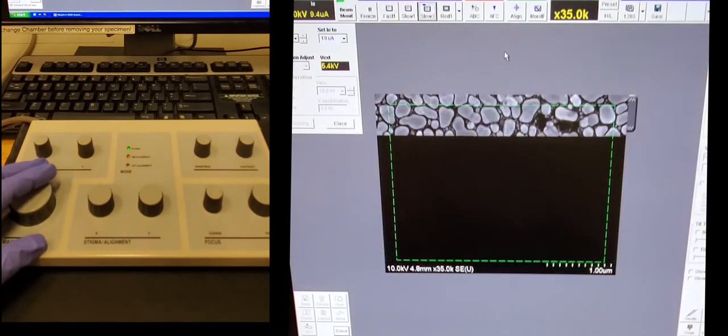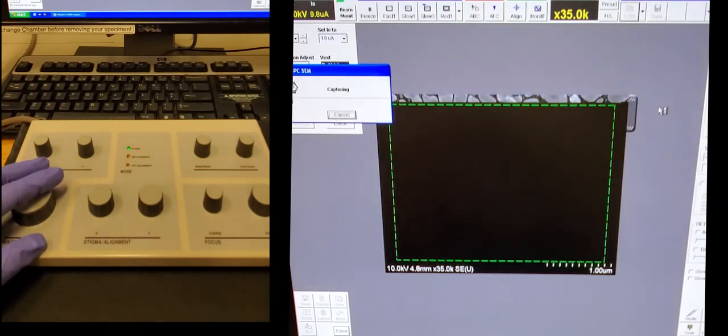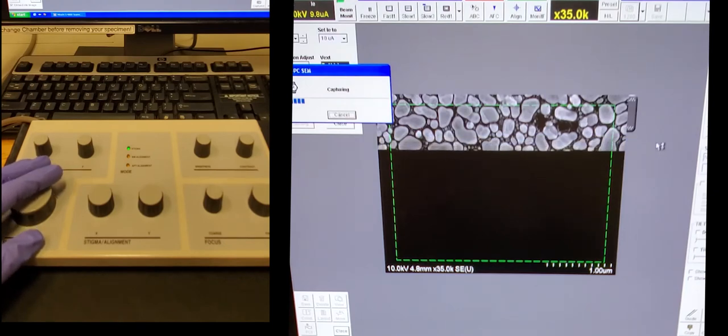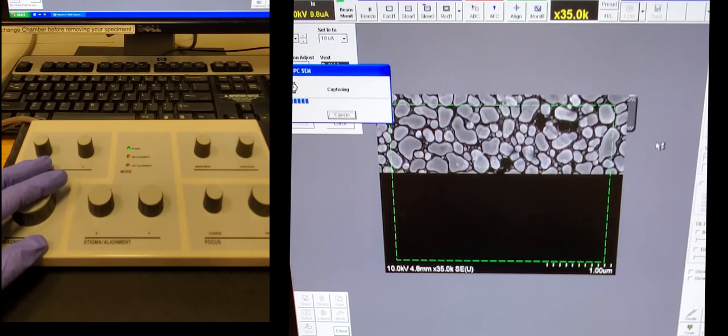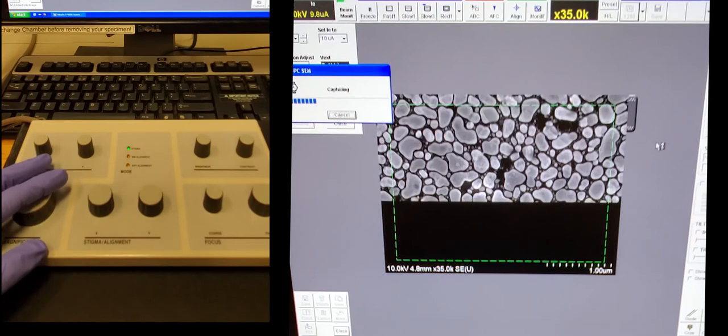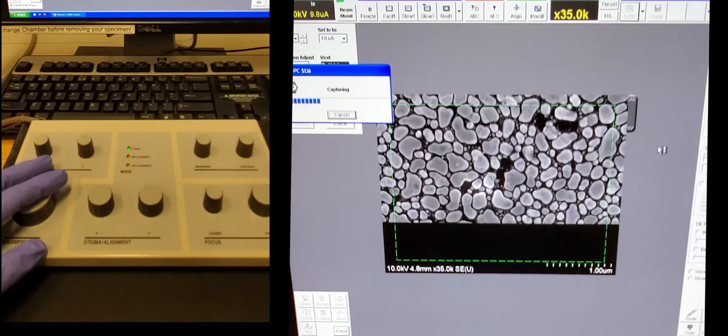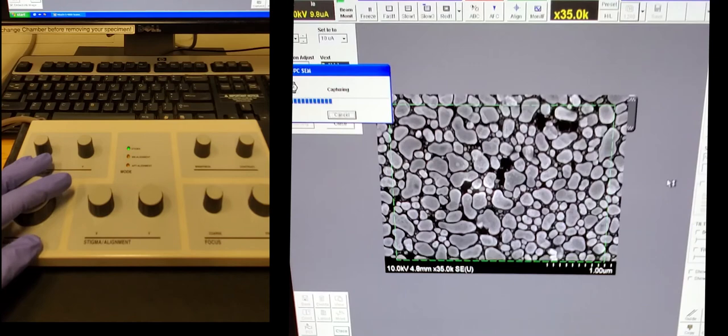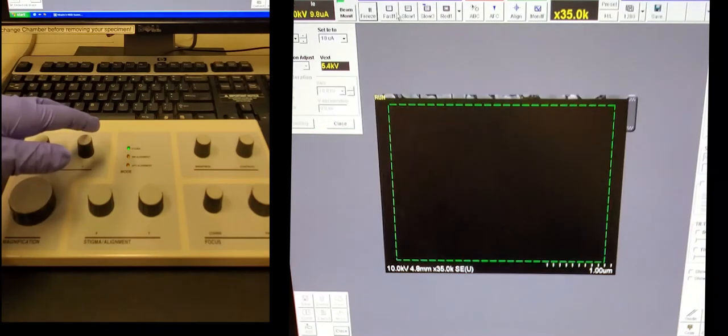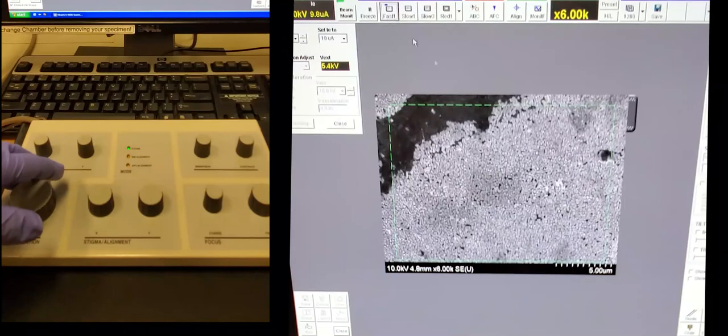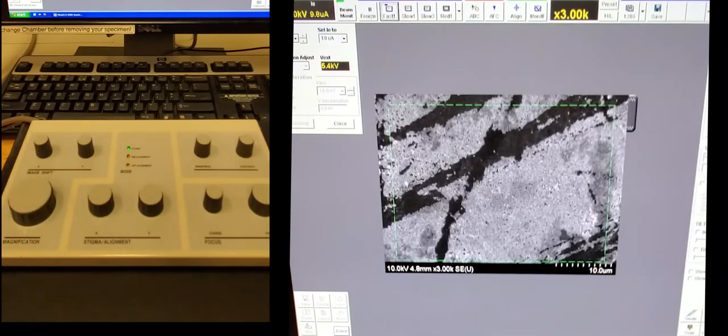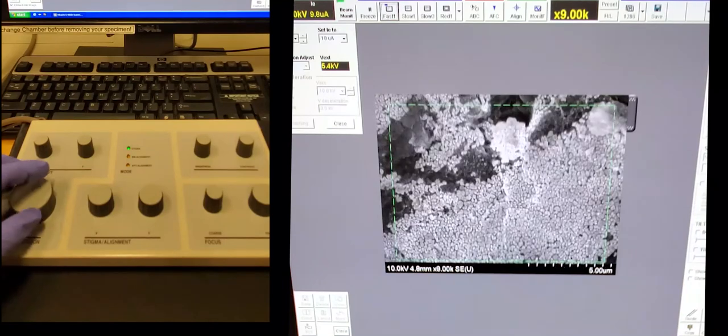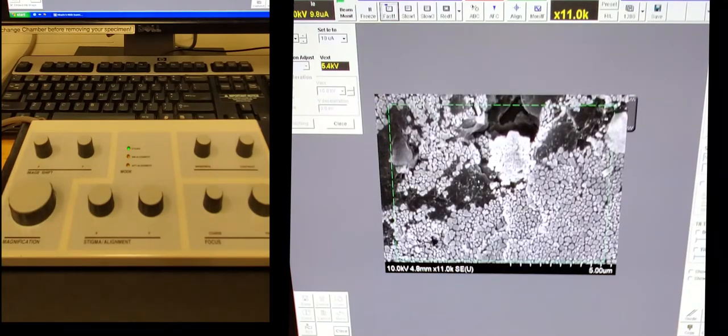You navigate around, decide which image you want to save, choose your speed and then press the capture. Since this image was sharpened at the higher magnification, I did not have to refocus it. I just had to zoom out and press capture again. Go back to run and fast scan and navigate somewhere else.